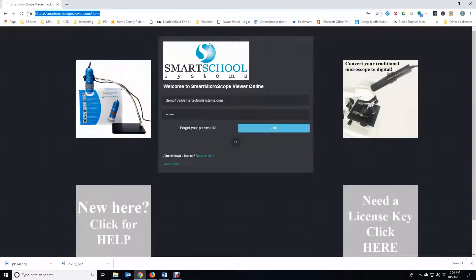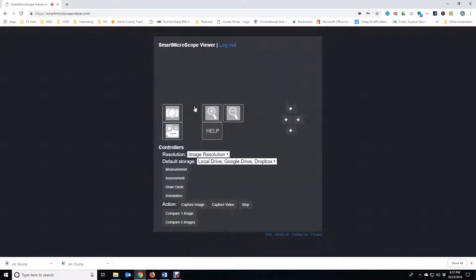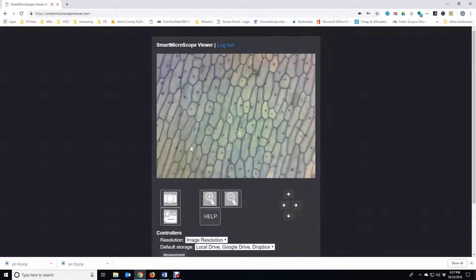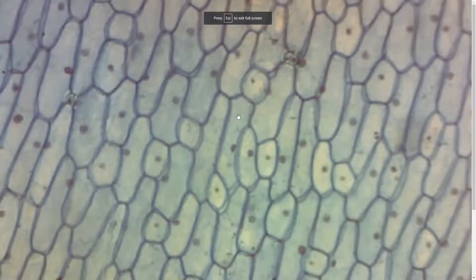Open the Google Chrome browser and go to smartmicroscopeviewer.com. Enter your username and password and click OK. You now see the live image.